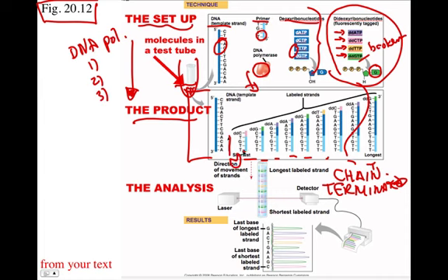It grabbed hold and it added a T, a T, a G, and a T, and those were all the good nucleotide precursors, but then it accidentally happened to grab a dideoxy CTP chain terminating nucleotide, and that one stopped there. And this is just showing that that happens at every nucleotide, because there are millions of different DNA polymerases in the tube. There are chains that got terminated at each of the letters.